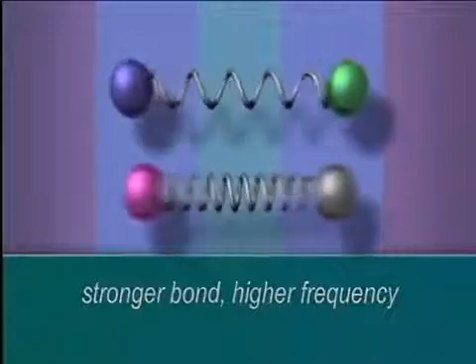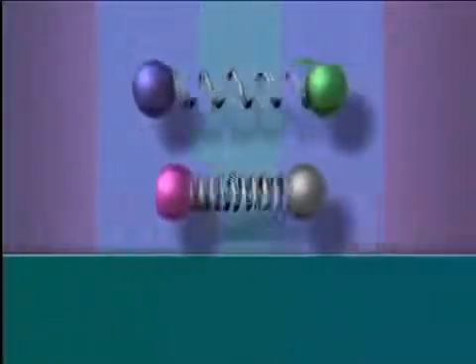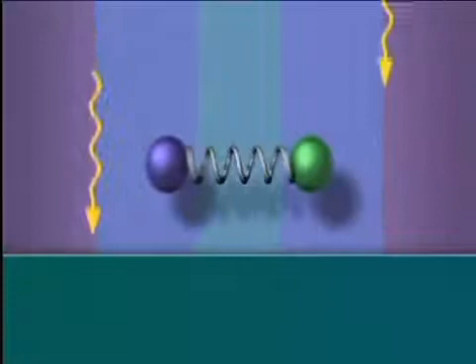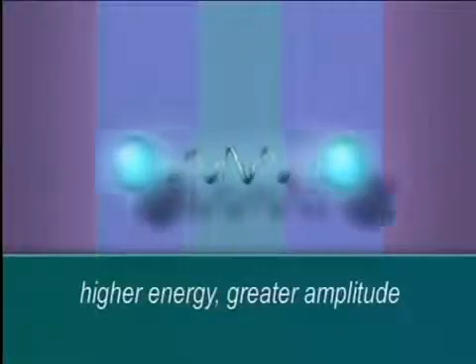At room temperature, most bonds will vibrate with the lowest possible amount of energy. But if radiation of the right frequency is supplied, the bond can absorb energy and vibrate with greater amplitude. Most bonds absorb energy in the infrared region of the electromagnetic spectrum, which corresponds to heat.